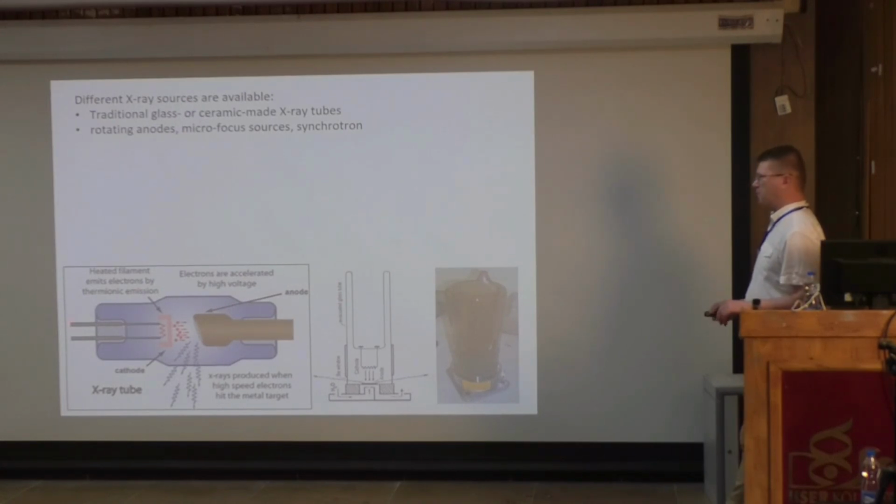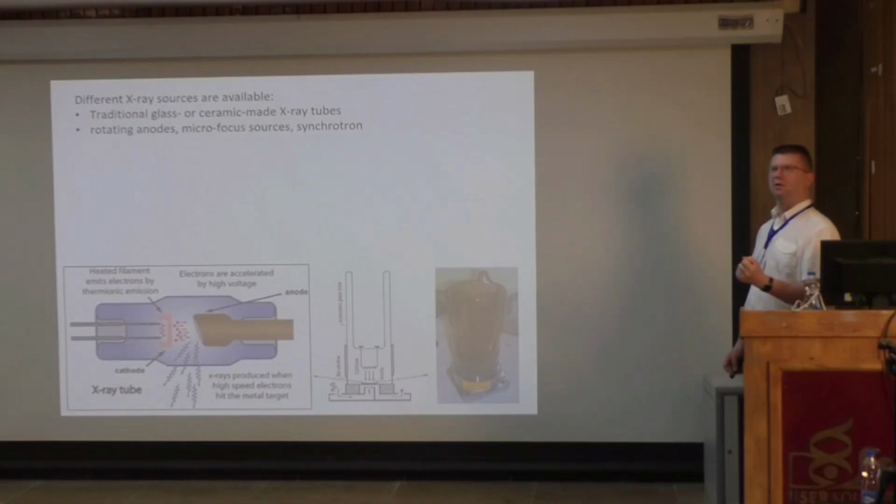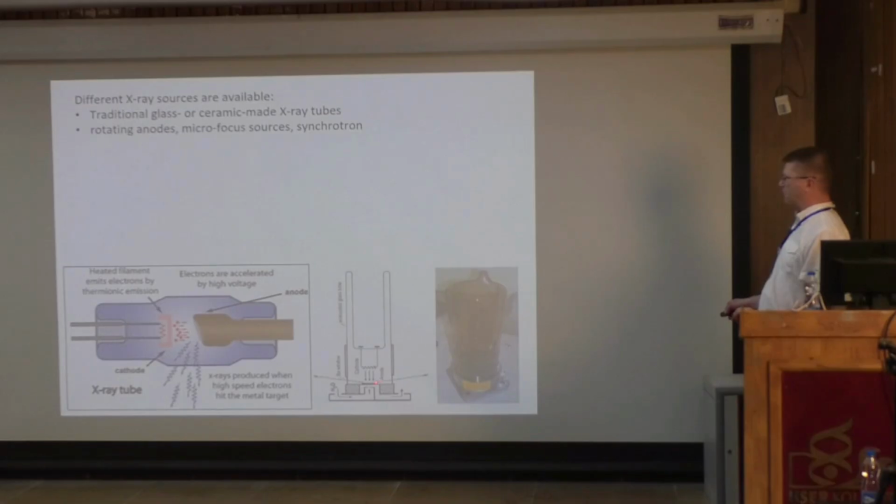It's a really nice thing, and here we have a picture of it. So this is about 25 centimeters times 10 centimeters. Weighs about 3 kilograms, 4 kilograms. In my course, I always show one. I have one whole tube so everybody can see how it is. And this is now the cartoon of this. And now you can see that the X-rays are created in this direction, but they come out sideways.